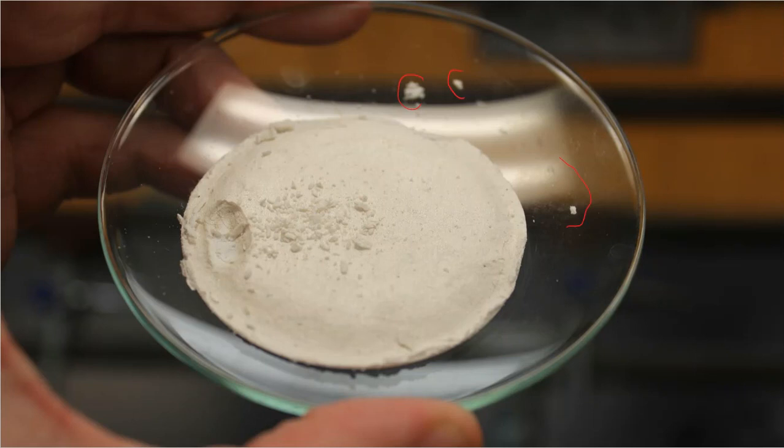That's why I used the watch glass. I knew this was going to happen. And then this way you can make observations of the crude product. I will say, though, this is not white. It's very shiny and reflective. Again, it's like a pearl. Very strange color and sheen and shimmer onto the surface of these crystals. Nothing really that we've worked with so far has done that to us.